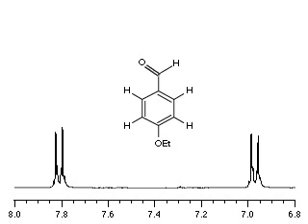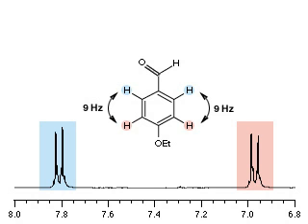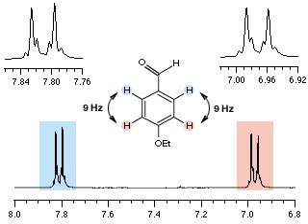One characteristic splitting pattern is the pair of doublets observed for para-disubstituted aromatic systems. The 4 aromatic hydrogens belong to 2 sets which are coupled to each other, but only the ortho protons contribute to the major splitting. These doublets exhibit extra lines because of complex second-order coupling that cannot be explained by simple rules. Such second-order coupling is common in aromatic compounds.